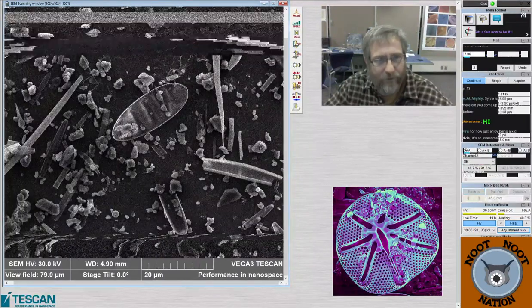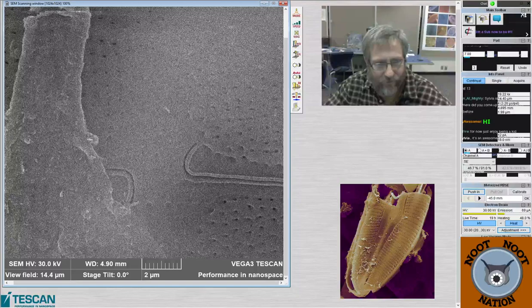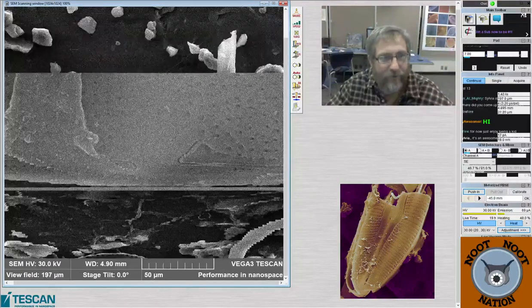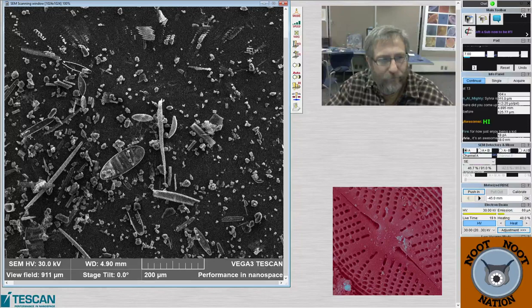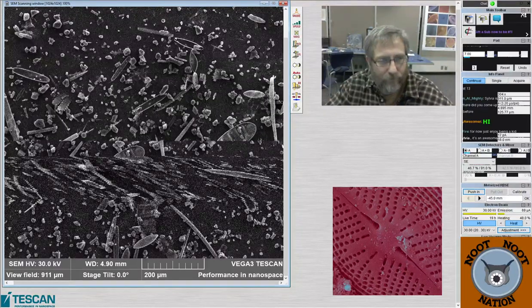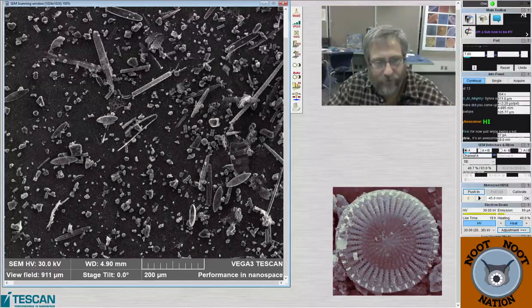Kind of concerned about what this is. Oh, it's another Nitzschia. Yeah? Where's Pandemic Watch when you need him? There's a bunch of them. There's one here, there's one here, there's one here, one's here. There's a whole bunch of those Nitzschia.